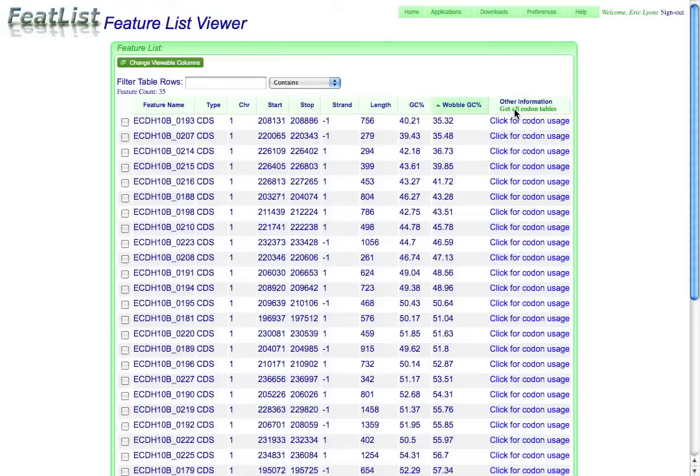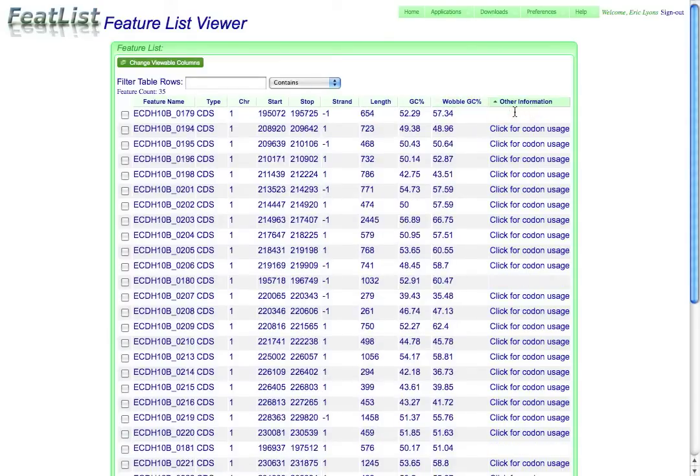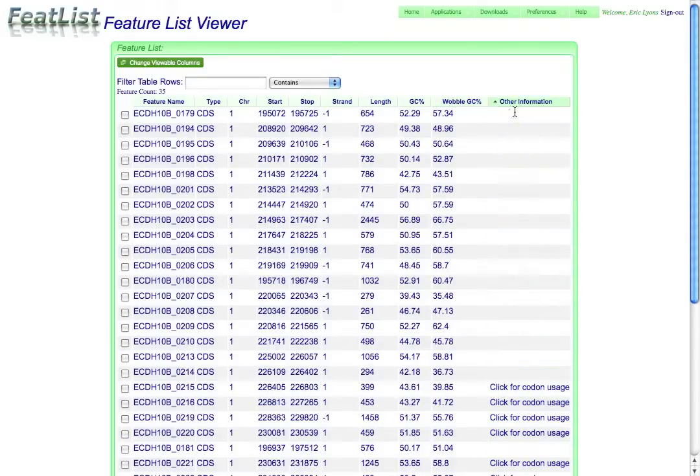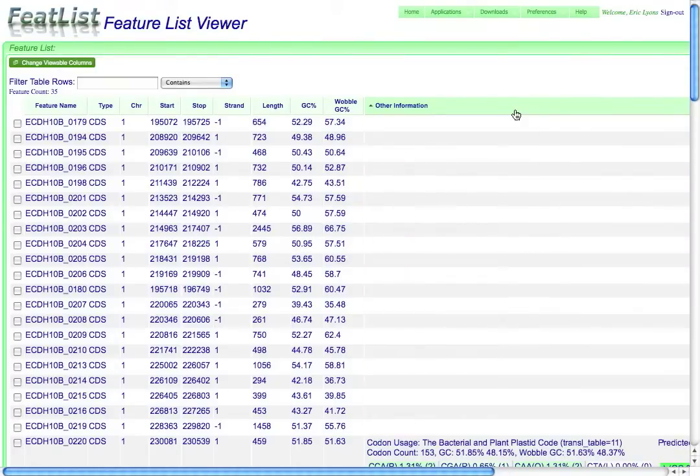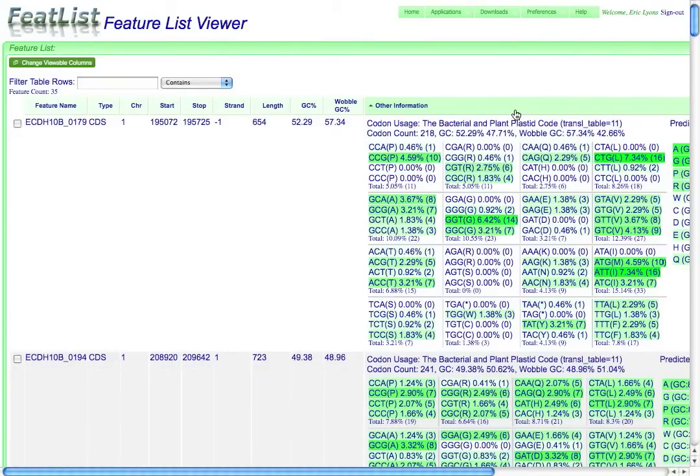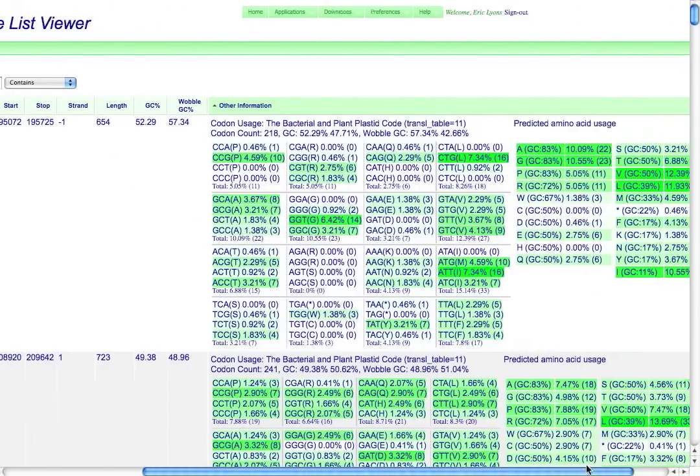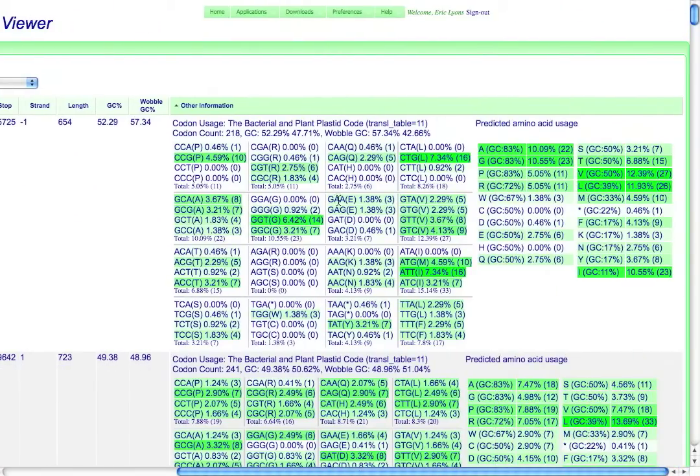If I wanted to generate the codon usage tables, all I need to do is just say get all codon usage tables, and this will now go out to the Koji system and start generating these for each one of these protein coding regions, and I'll get a usage chart of all the codons, as well as the predicted amino acids for which they code.